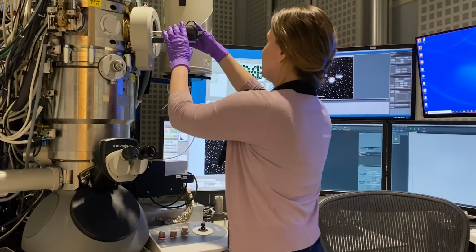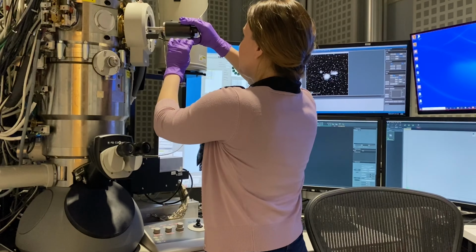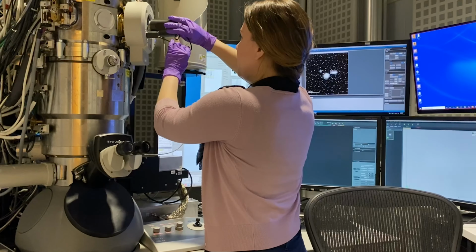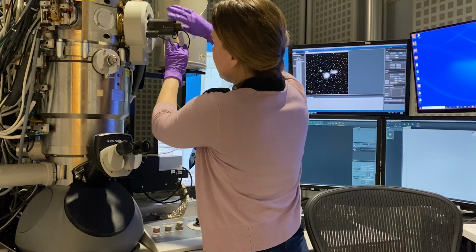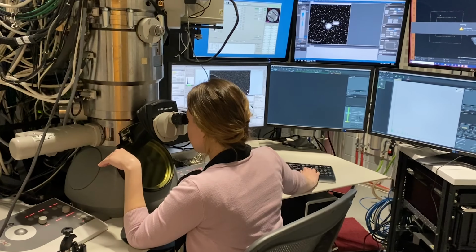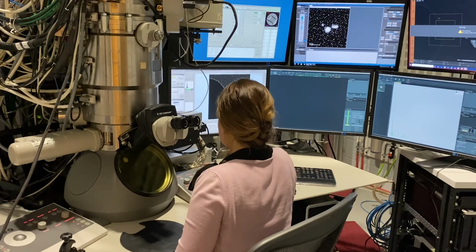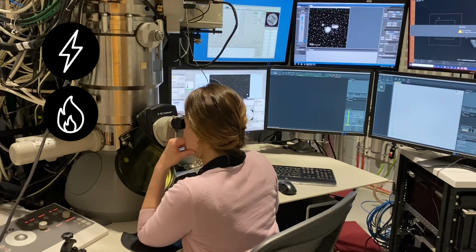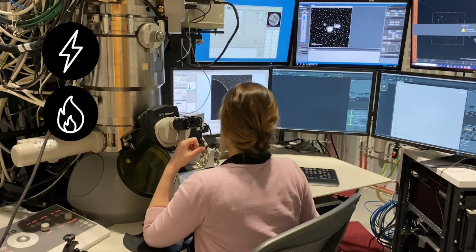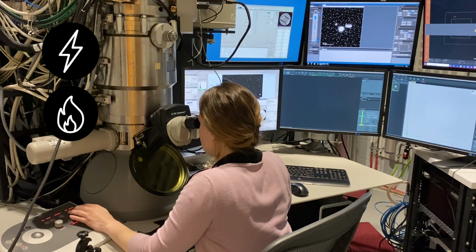As we shrink these devices down, it becomes crucial to understand how tiny changes at the atomic level impact their performance. This is where transmission electron microscopy, or in situ TEM, comes in. TEM lets us observe how electronic devices behave at the nanoscale in real time. Using in situ TEM, we can simulate real-world conditions by applying electrical currents, voltages, or heat to a sample while observing what happens in real time.